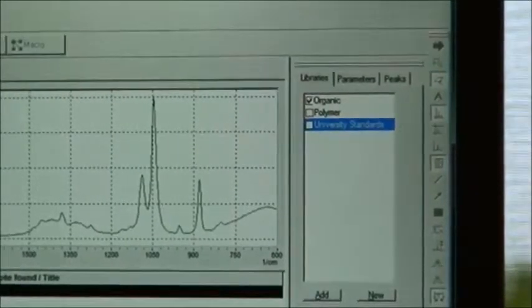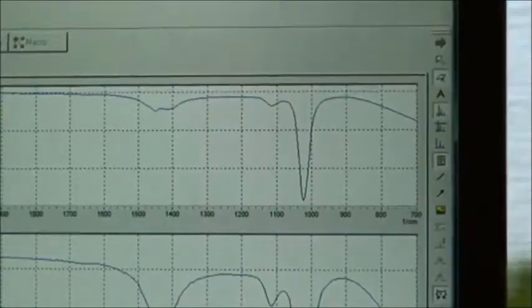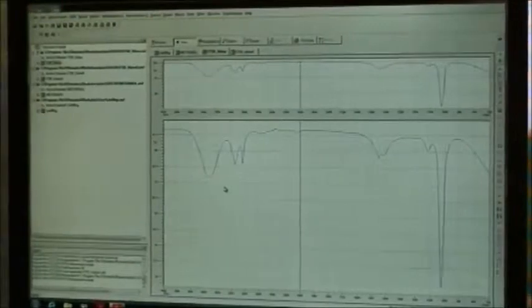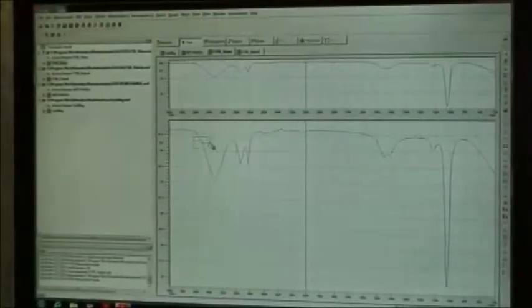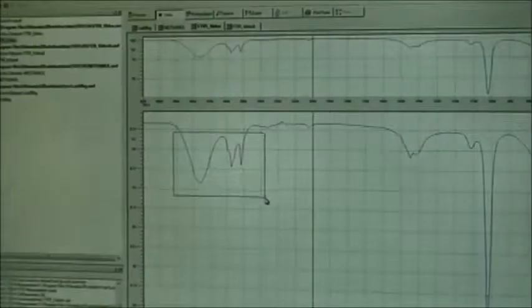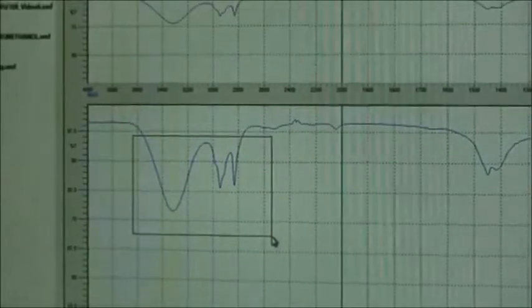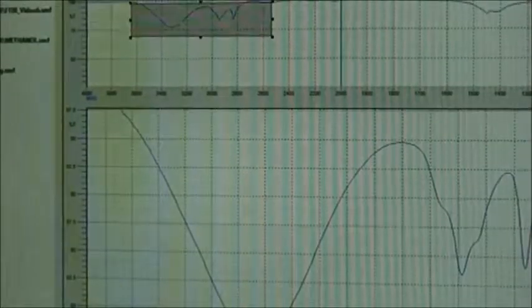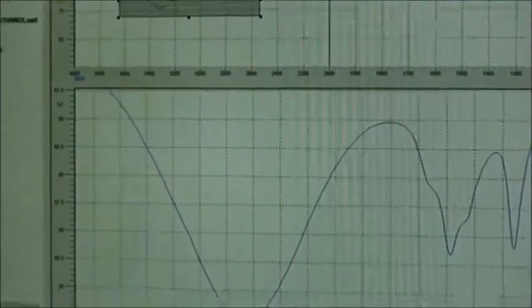If we come out and go back to view, and if you wanted to examine a particular peak, you can right click, drag your mouse, and you can right click, release, and click again. And you can get a closer view of your spectrum.